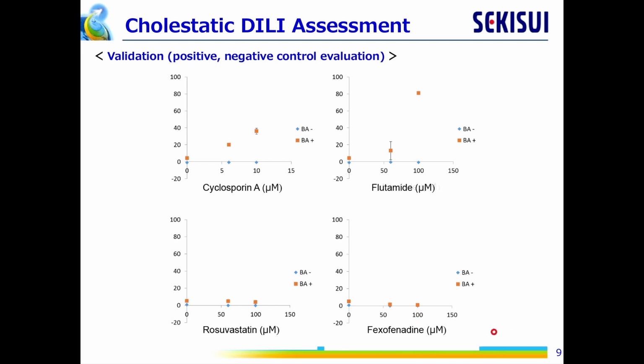The data is not shown in this presentation, but we also conducted the same test using other hepatocyte lots to check the lot-to-lot variation. The same pattern was observed.